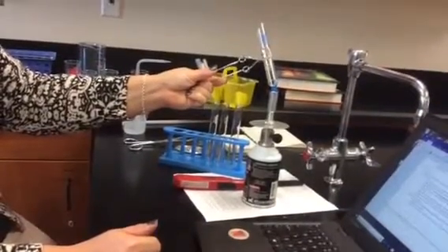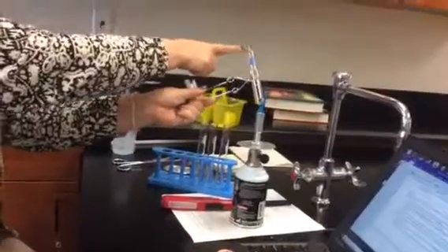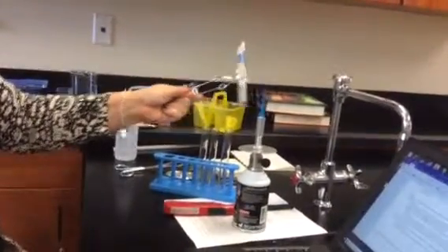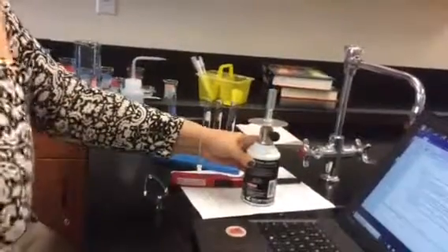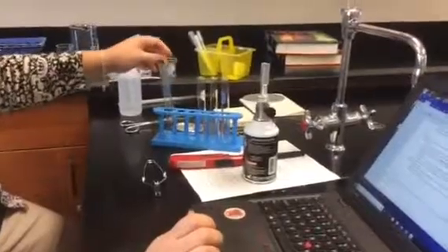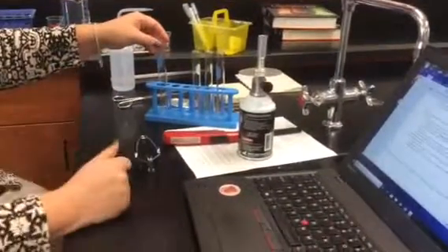If Ty was my lab partner and it was me, the opening is not facing towards my partner and it's not facing towards me. That's the way you heat it up. Safety. Safety. Oops. Okay, and then drop it back down in there. So that's that one for part C. And then I went on to do other reactions while this one was waiting to cool down.